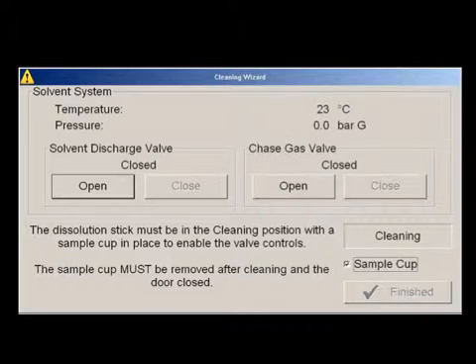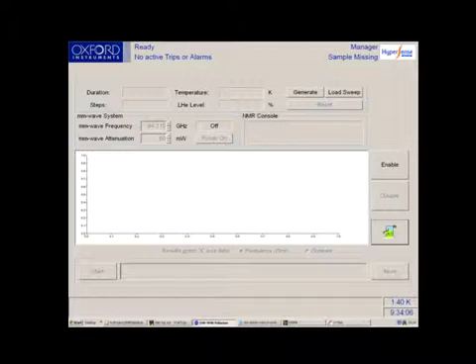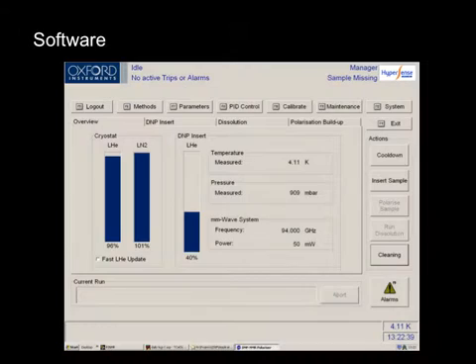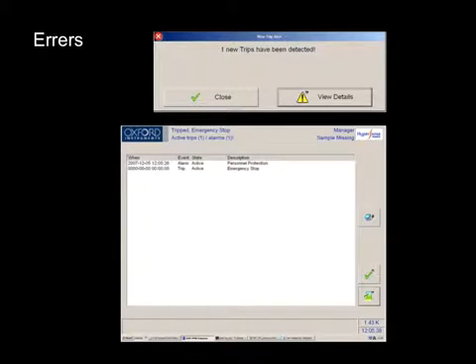So I think that's a pretty good summary of the operation of the Hypersense. I don't think we need to discuss the microwave sweep. We can talk about that in the lab maybe. Yeah, there's a few other things to be aware of, errors that you can run into. So this will be covered a little bit more in the lab, I think, today. Is Mark VC running or is he kind of doing stuff? So he'll be demoing some possible failure modes, I guess, of what situations you can run into on the system. So I'll leave that to him.